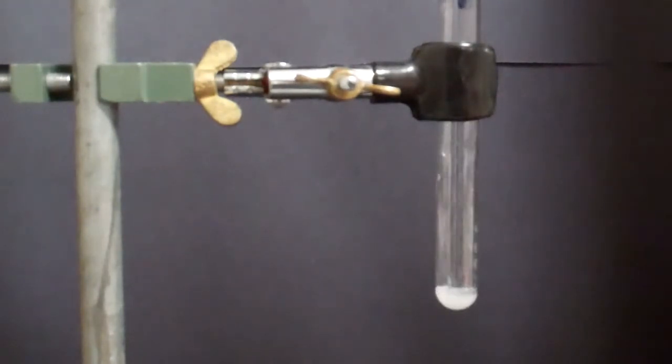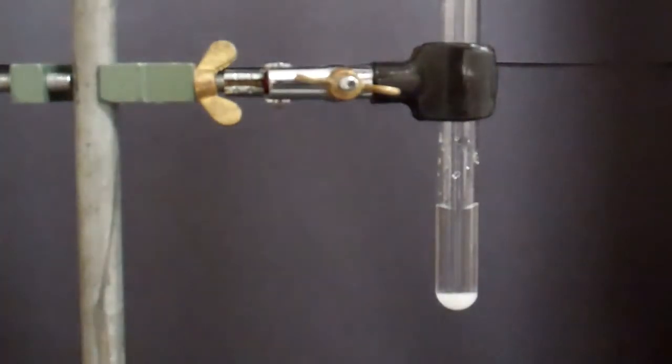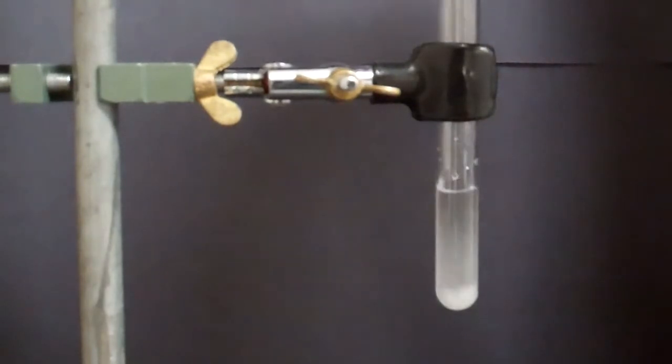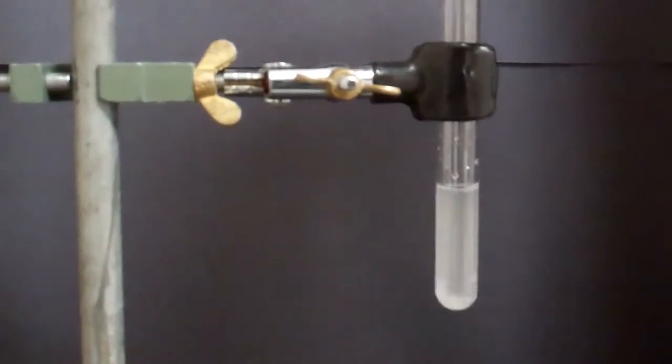We're going to fill up our test tube with a third of distilled water and we'll stir to dissolve. We want to make sure that this is completely dissolved so that we don't get confused with our results.